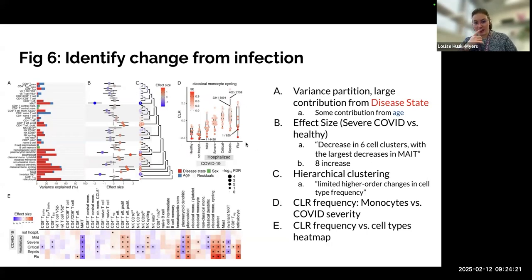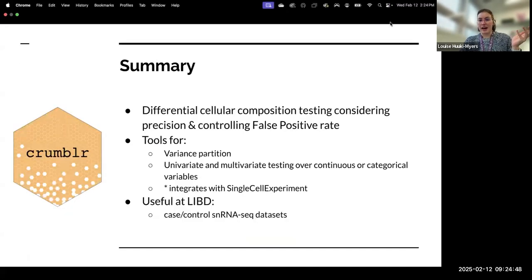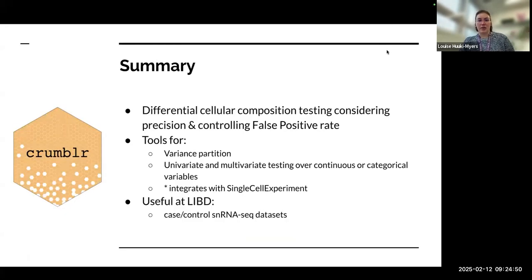And then another way that they presented that, if you wanted to explore a lot of cell types, is they made this heat map of sorts where it represents this, but broken down. I think it shows the effect size across. You can look and see if it's becoming more positive or more negative. So this is another way to display the effect size that we see in B. All right, that was it. So they have that same range of plots.